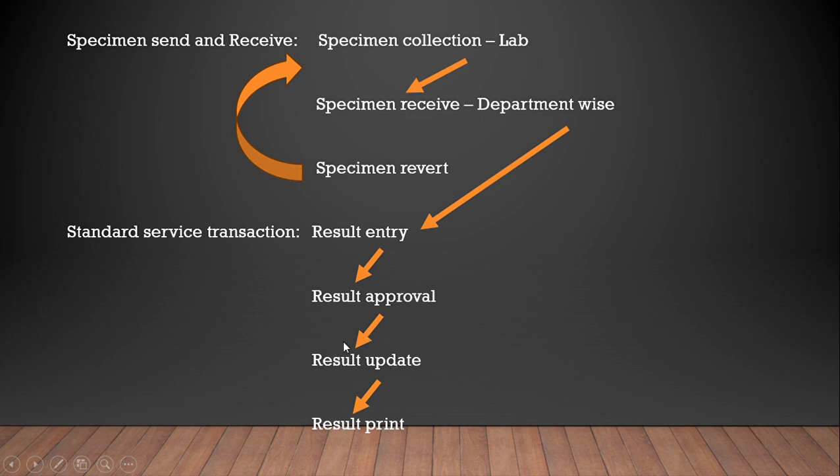Usually update means that for an approved report, whenever you are going to change or update it, you have to inform the people who are involved, because they may have taken a call already. So you have to change it. When you change the approved report, it is called result update. That needs to be informed. These all become what you call amended reports.